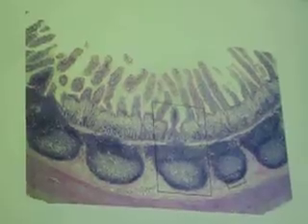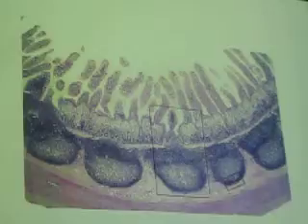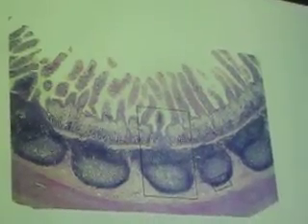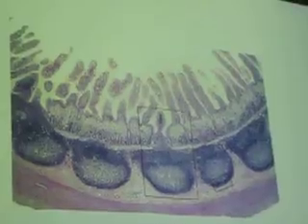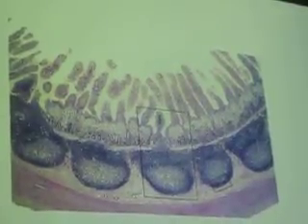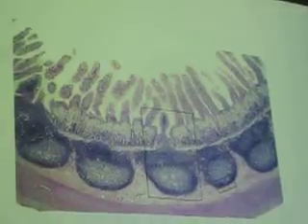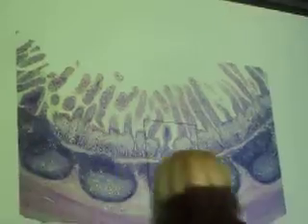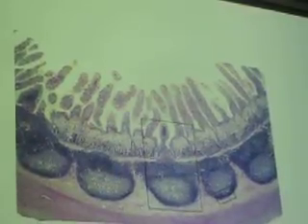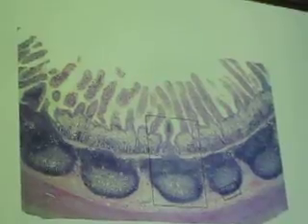We've got a lot of beneficial bacteria in the large intestine or the colon that stays in there to help us digest things and help us create vitamins. We don't want those things getting into the small intestine. We want to keep them in the colon. When they do get into the small intestine, it can wreak all kinds of havoc. They grow out of control and then make you sick, right? They interfere with absorption. So you must be looking at the ileum because you see your Peyer's patches, right?